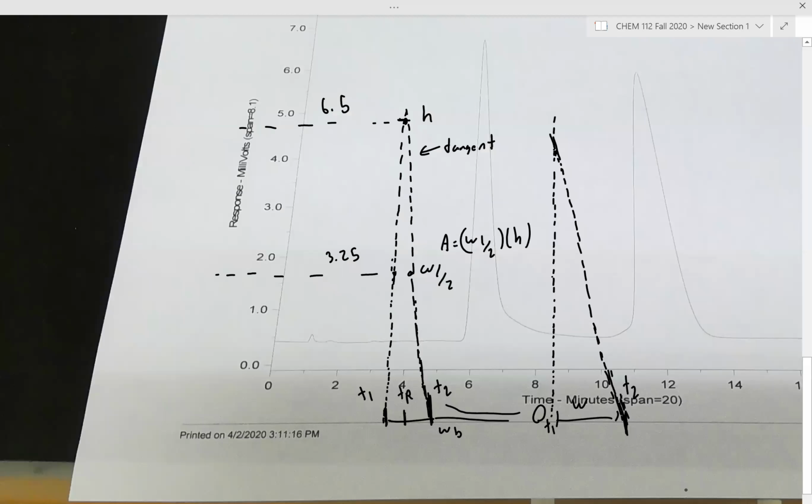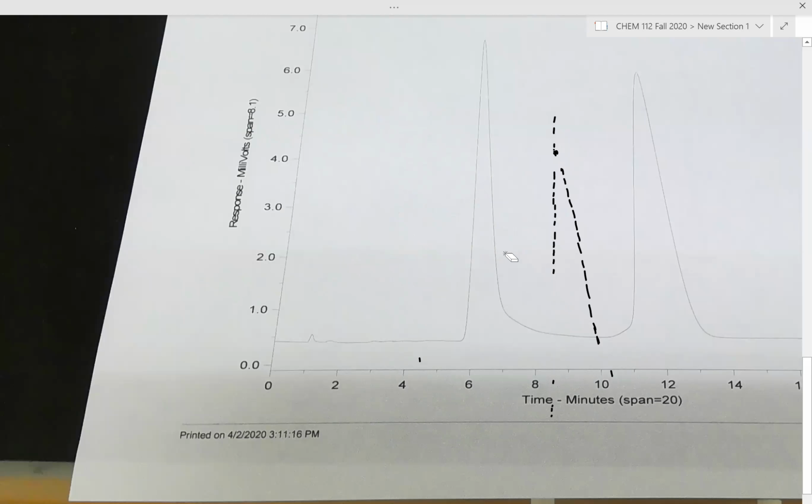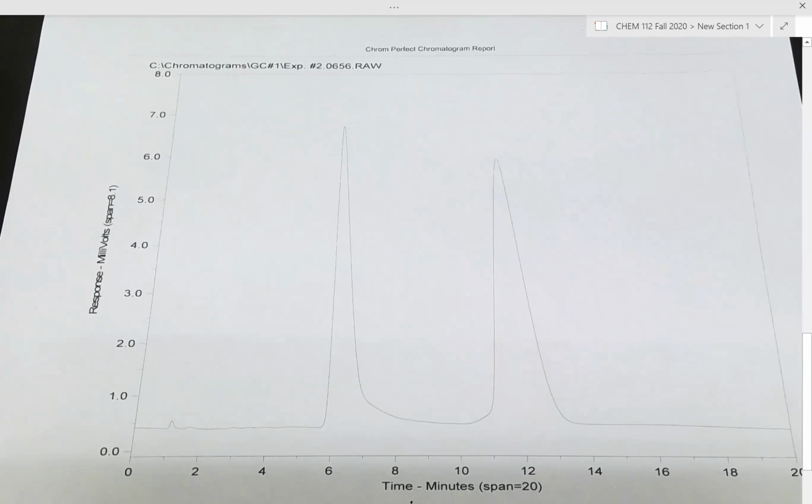To show you an example of how you would analyze a chromatogram, allow me one moment to clear off this previous annotation. We're going to look at a sample chromatogram readout, and talk a little bit about how to process this data. This is exactly the kind of raw data that you would be processing in this lab. Okay, so here is our chromatogram.